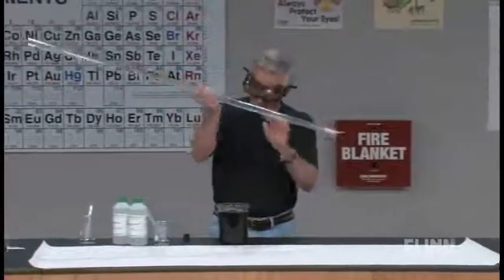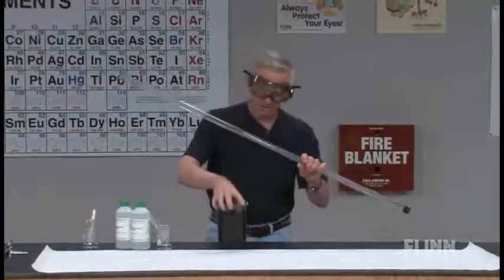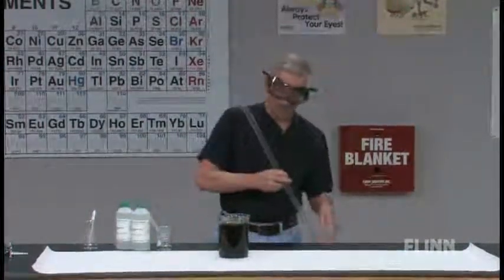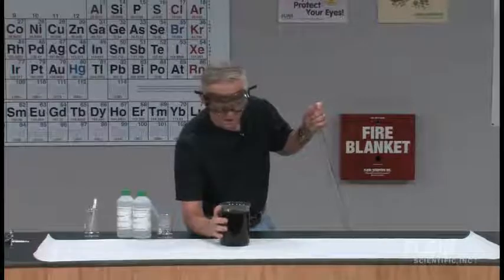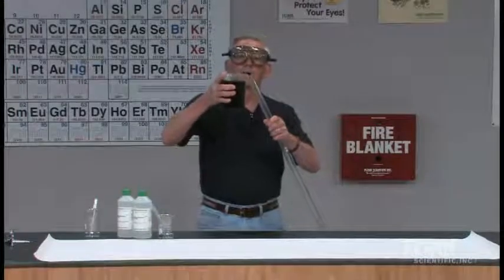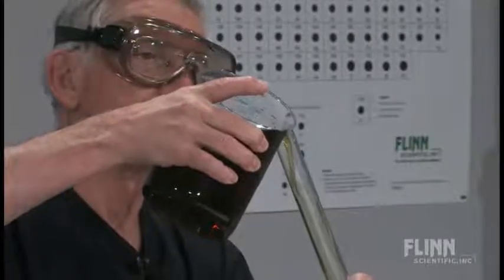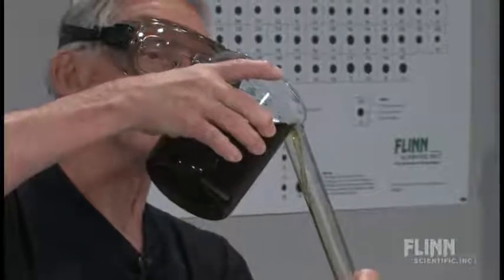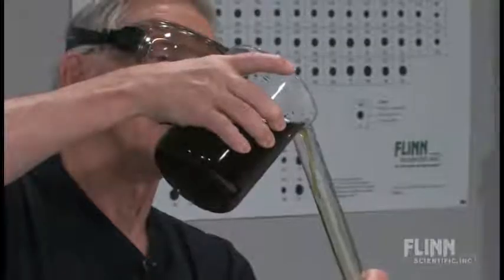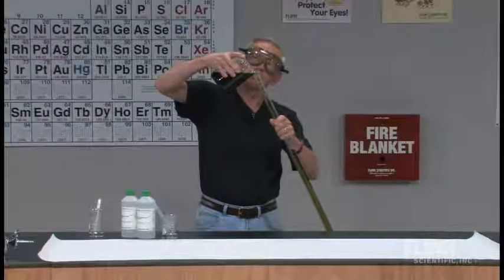I've got a tube with stoppers at both ends. What I'm going to do is put some of this solution, which is simply distilled water with universal indicator in it. I'll know it's getting full when my left hand gets wet. The green color tells us that the distilled water is neutral.